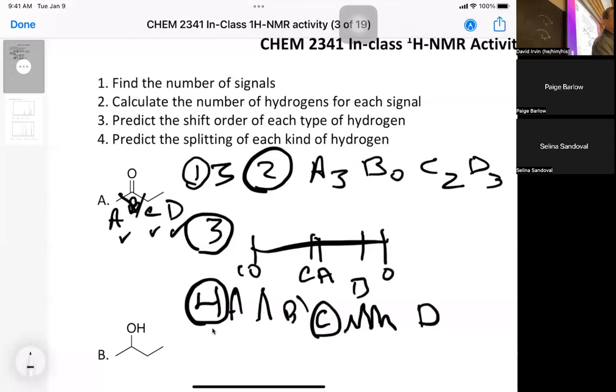Oh yeah, B we don't have a peak. D carbon is going to be how many peaks? 3, because we have 1 for the hydrogens plus 2, 3 for the 2 hydrogens within 3 bonds. So we're going to do 1, 2, 3.